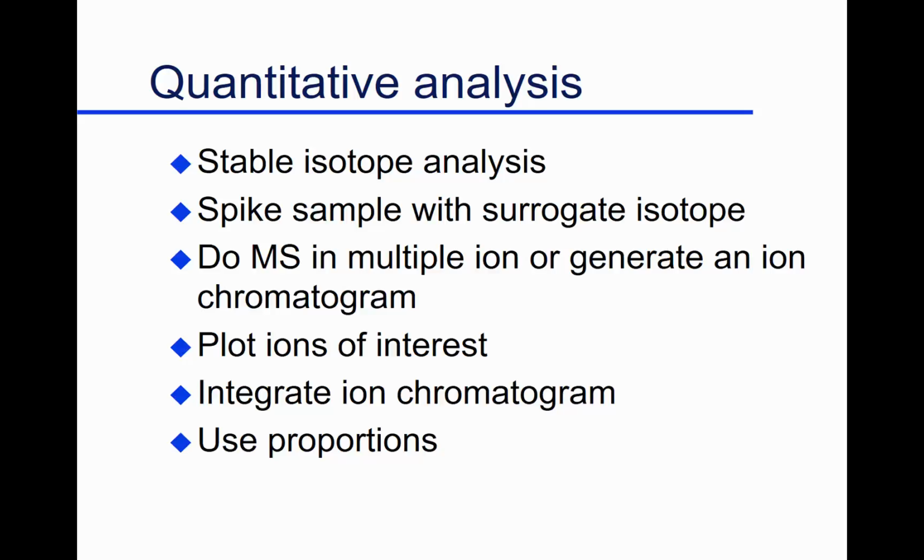So you can actually compare the two areas. If the area of your spiked sample is the same as the area of your peak for benzaldehyde, you'd say they're the same concentration. Or you proportion it. If it's 1/3, what you put in is 1/3 the concentration. There's no better standard than the compound itself.